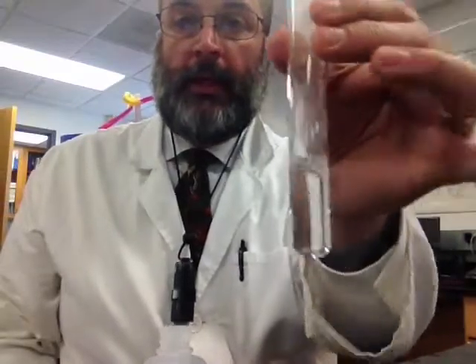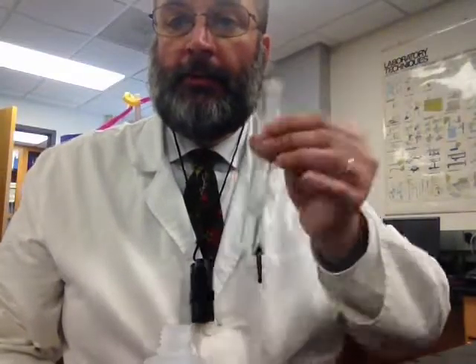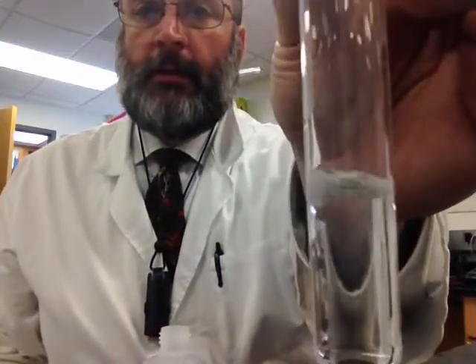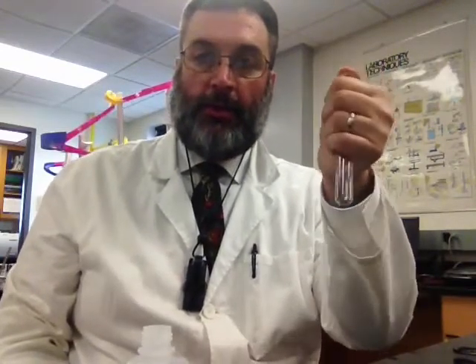Okay? Can you hear the sound? Okay? We've got something going on in there. Now, I've got some bubbles being formed, and we know that bubbles are indicators of gas. Okay? What gas this is, you should be able to figure out, but I can test for this gas. The gas that's being formed here should be hydrogen, right? And I can test for hydrogen because hydrogen is flammable.